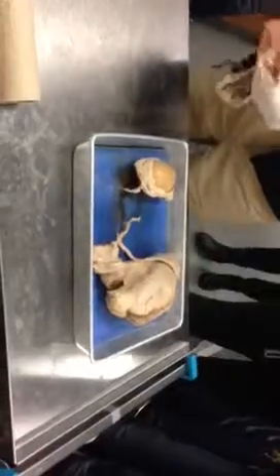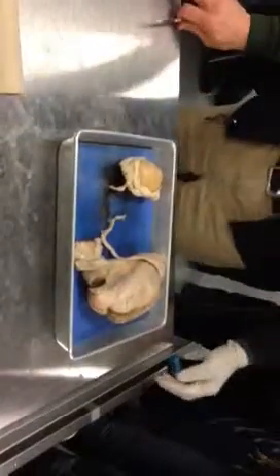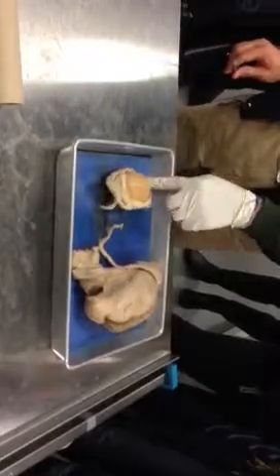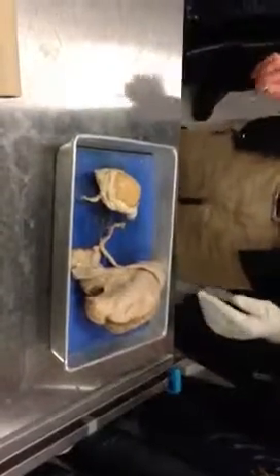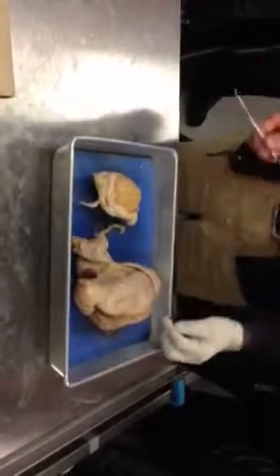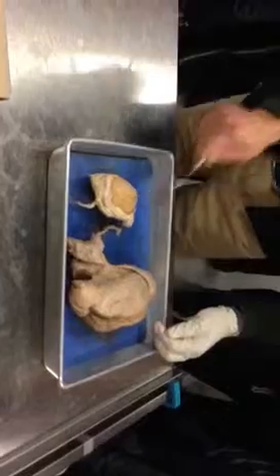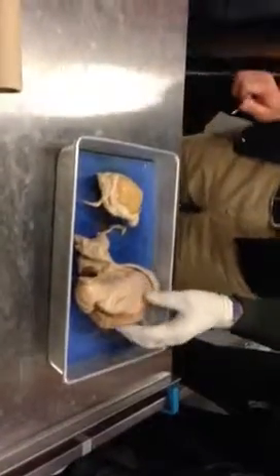Okay, everybody, so if you have your blue sheet, we'll go through bull testicle. It's not too hard. We learned a lot in the theory part, so we'll just see the real deal here. This is a sheep testicle. They both may be on the practical. Most structures you can see on both. The bull testicle shows most things a little larger anyway. But there's one thing on the sheep testicle that you can see better.